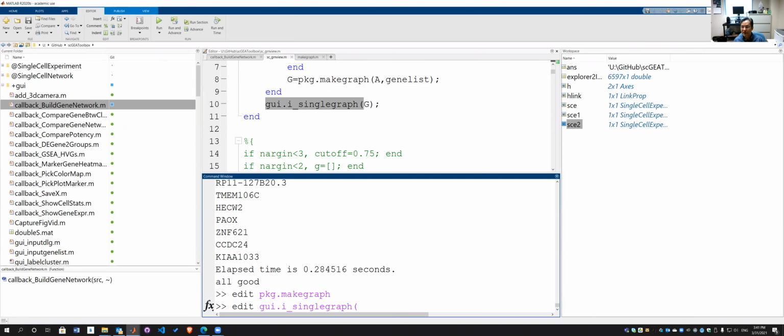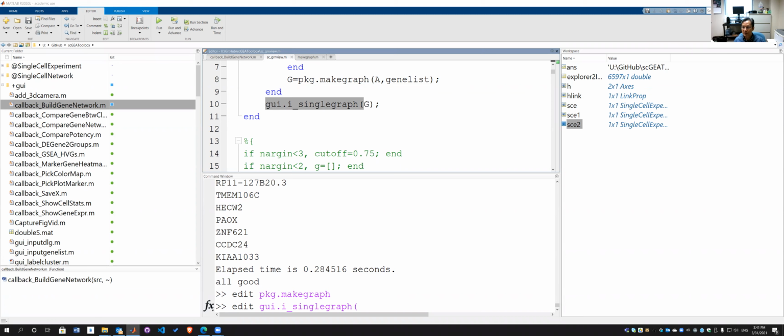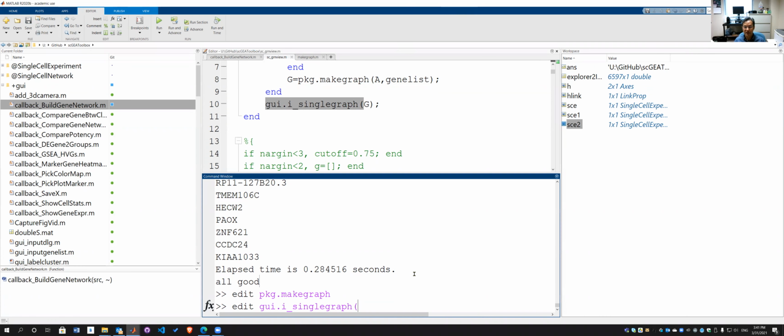Okay, if you don't have any questions, feel free to leave, and I will let you know once I fix the problem so that you can re-download the package. You should be able to run the program to construct a network.